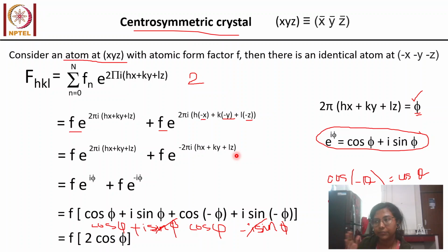When they diffract and you collect the spots, each spot is collected in the reciprocal space only.